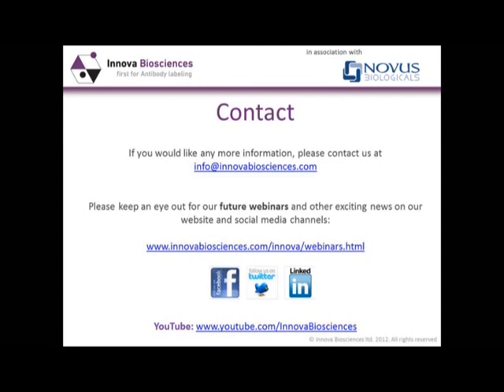Okay, and we have a question from Ashin all the way in Manitoba in Canada. He's wanting to know how to overcome autofluorescence. In actual fact, Ashin, autofluorescence is an inherent state of the cell, so it's quite difficult. Cells such as dendritic cells, for example, have their own typical autofluorescence profile, and so you can actually start to look at using autofluorescence as an indicator of cell type.